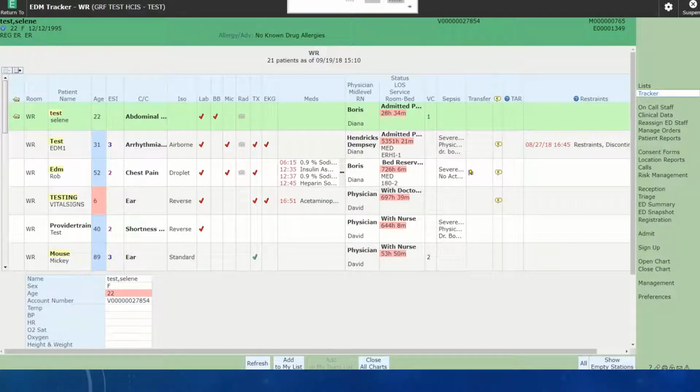In this video, we are going to discuss mobile phlebotomy, which is the new system we are going to be using to print out our phlebotomy labels to label our blood specimens or urine specimens or any microbiology specimens we send on a patient. So we would start off first looking at our tracker, and we would see that there is a lab category, and we could see that there is a lab order.